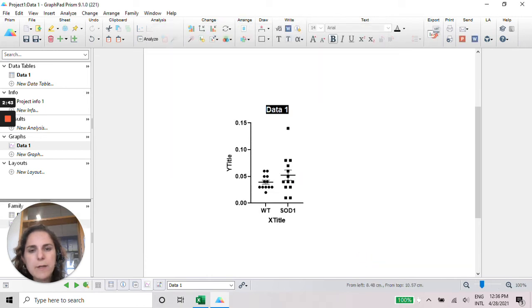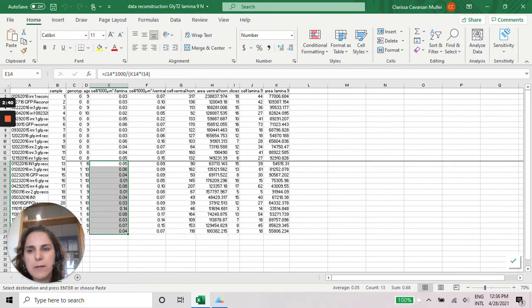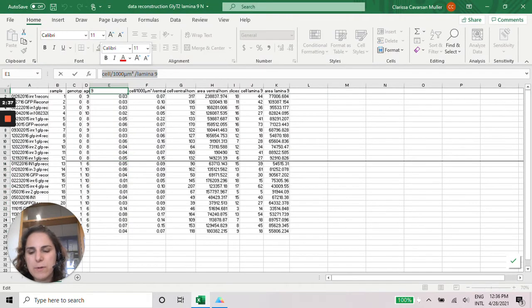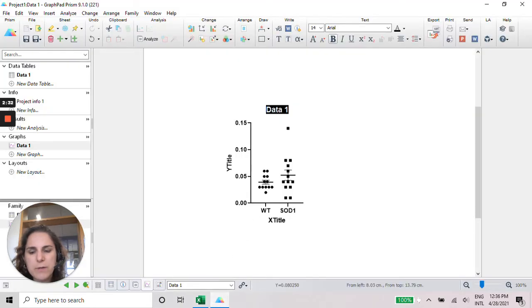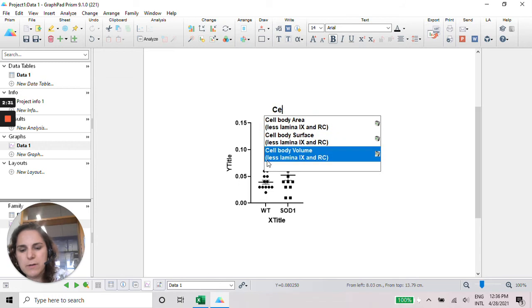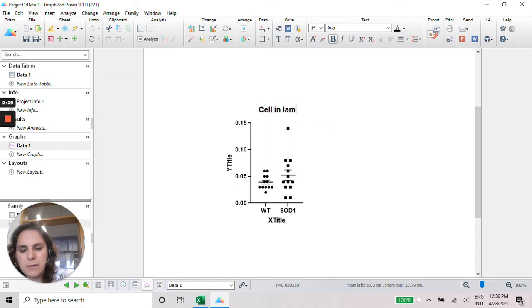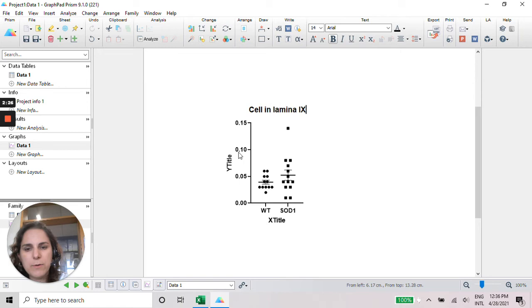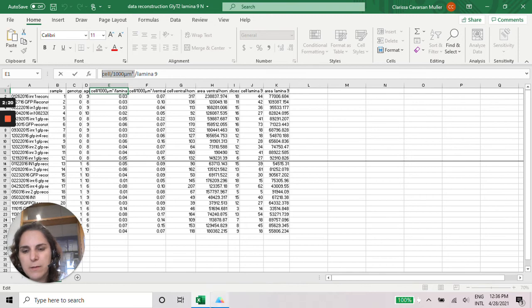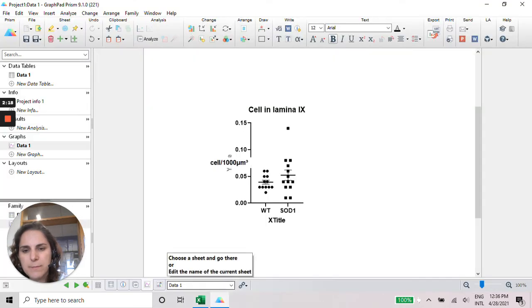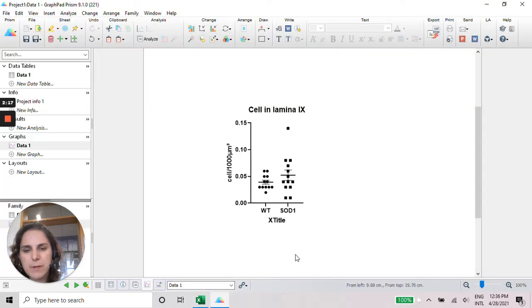After that we can change here for our data. So this is what we have here. Cells in Lamina 9 is the name of our graph. And here it's going to be our scale. Okay.